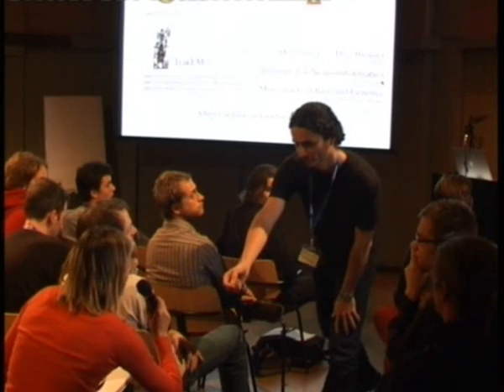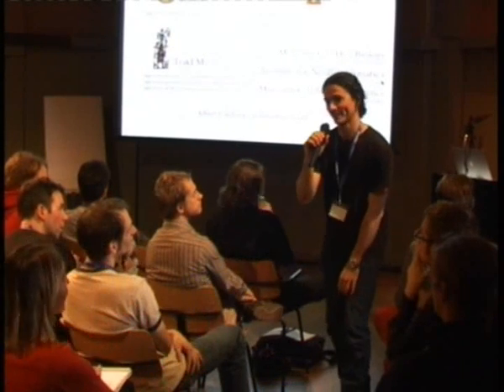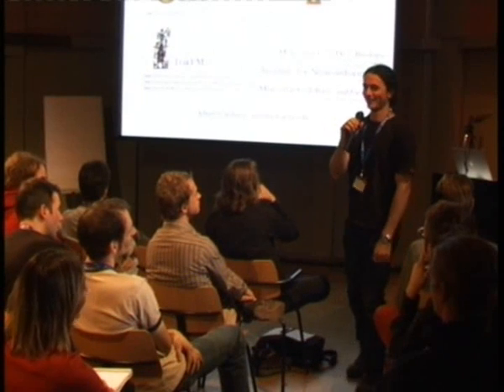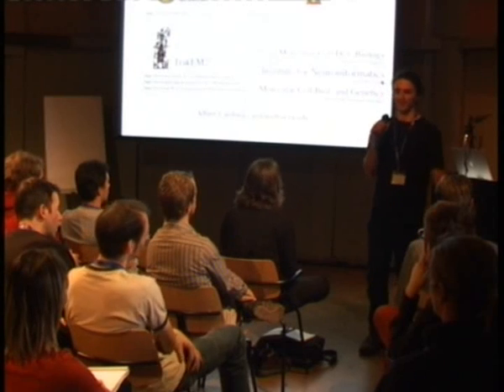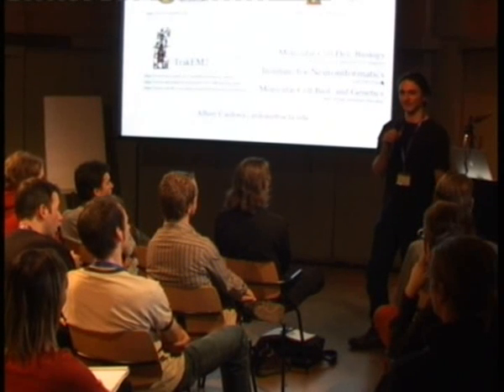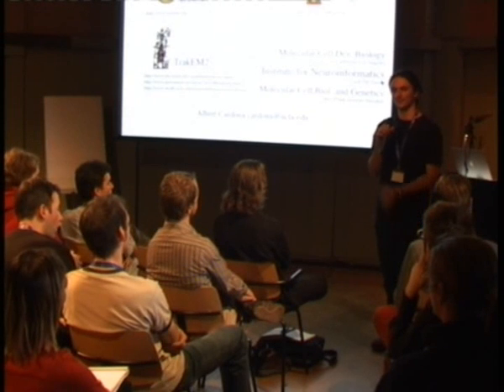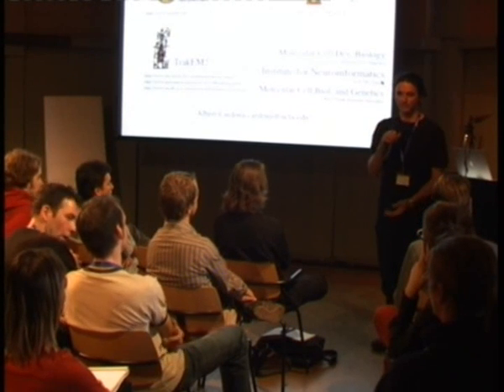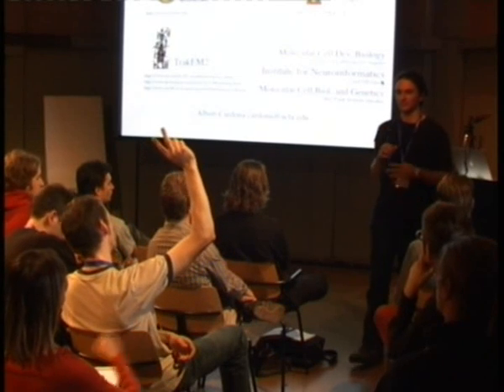Or do you have a semi-automated version? I don't have a semi-automated one. I'm working on it. I have some guys in Zurich, actually, real computer scientists who are trying to figure it out, at least to make it semi-automated. But it's not easy, because it depends so much on each sample. Each set of images has its own little pitfalls on how you can segment objects properly.